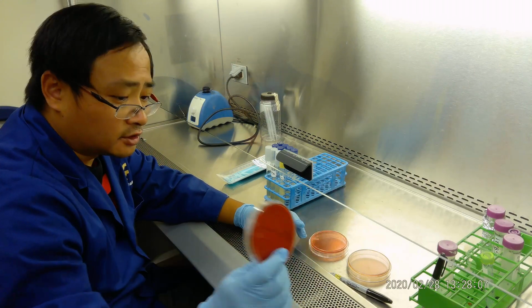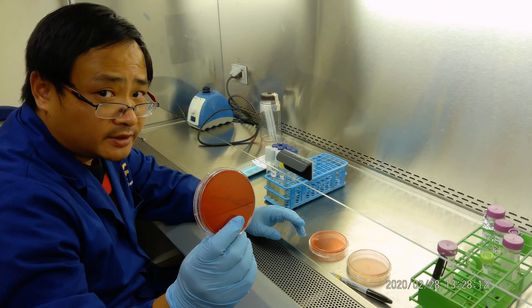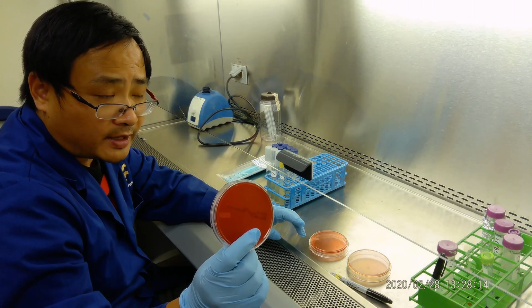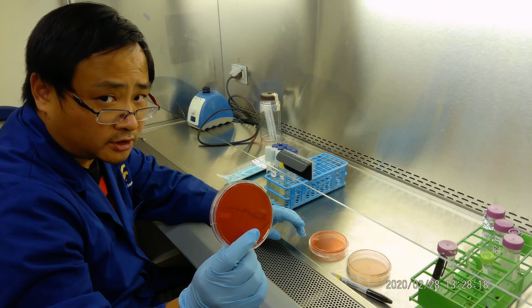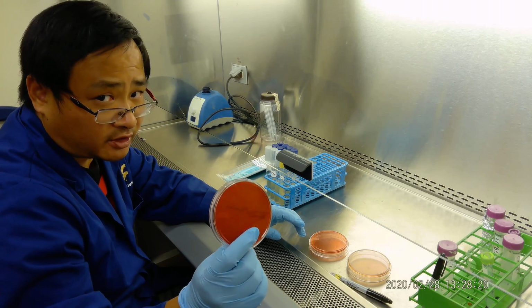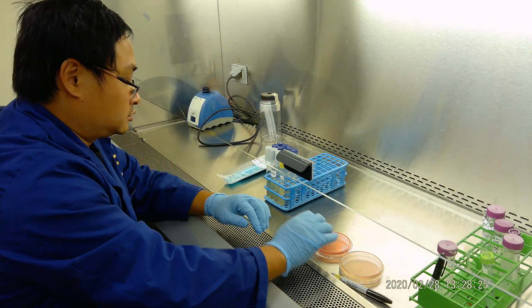Now blood agar is a tryptic soy agar with 5% sheep blood. This is an enriched media. Bacteria can grow dramatically. Also, we can differentiate based on beta hemolytic and alpha hemolytic. So we will do some very easy work right now.